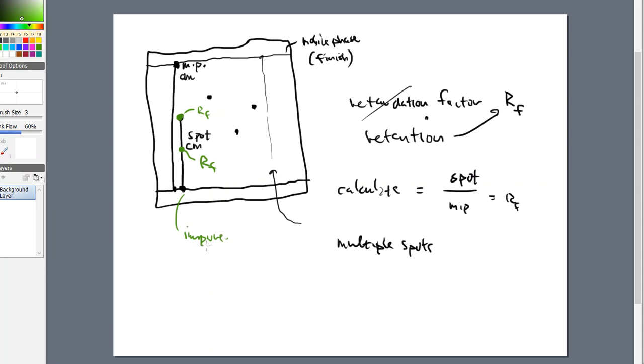Typically, if you're using a pure compound, it should have one spot because it's one component. But even things that we order in a lab sometimes are not 100% pure. It rarely actually ever is. So there is a chance that we will see multiple spots. However, multiple spots could also come from contamination on your end. When you begin to spot these plates, you could accidentally drip onto the plate if you're not careful. You could forget to switch your capillary tubes that do the spotting in the very beginning, and cross-contaminate those. So sometimes the multiple spots are due to your technique in the laboratory, but sometimes they're simply due to the components that we have in our lab.